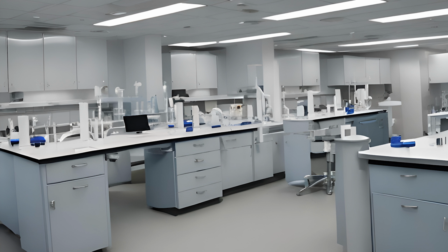Commonly, blood in the laboratory is cleaned up with a mixture of 10% bleach using the spray, wait, wipe technique. You'll spray it with bleach, wait 2 to 3 minutes, wipe it up, and then rinse it twice with a cloth that's been moistened with water. Just bleach on its own will leave a corrosive residue that can cause things to break down over time if you don't clean it off. Gloves have to be worn during this process.